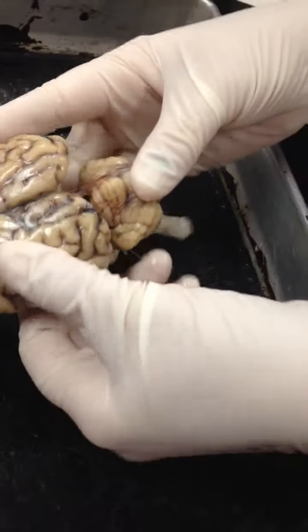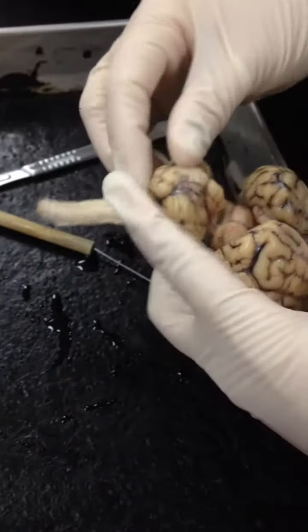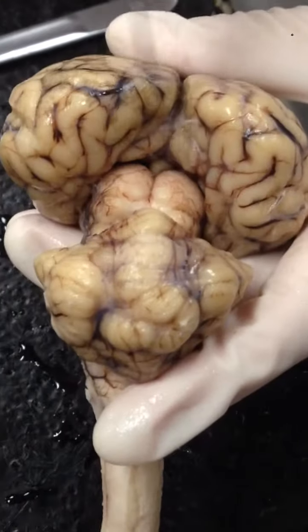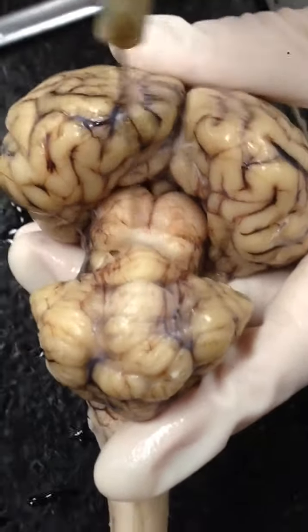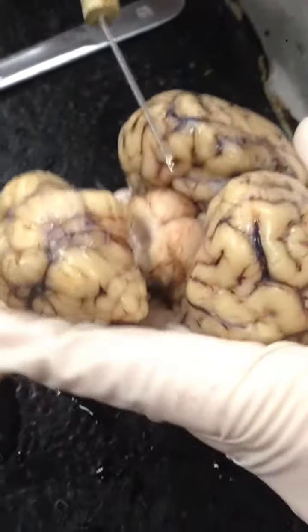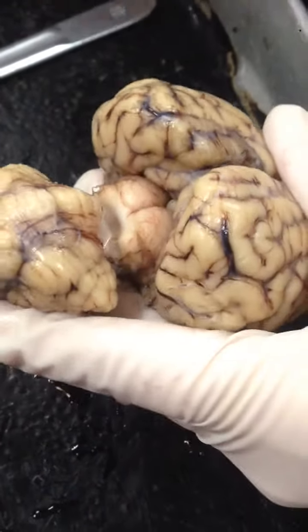If we take this, I could pinch it back. This actually is a really good one, and I'll show it to you from different views, okay? I call it a butt, the corpora quadrigemina, because it looks like a butt to me, okay? You have your superior colliculi and you have your inferior colliculi. So superior are up here, inferior are down here, okay? Together, they are the corpora quadrigemina. I think quad means 4, okay?